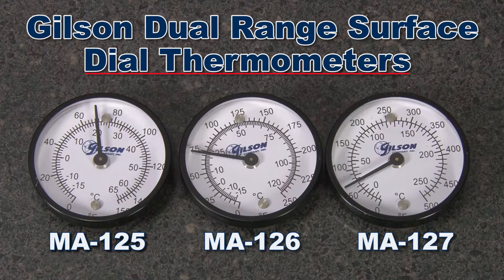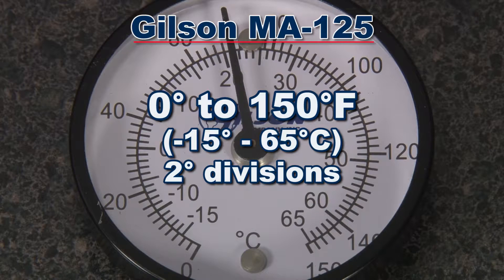Gilson offers three models to choose from. The MA-125 has a temperature range of 0 to 150 degrees Fahrenheit with 2 degree divisions.